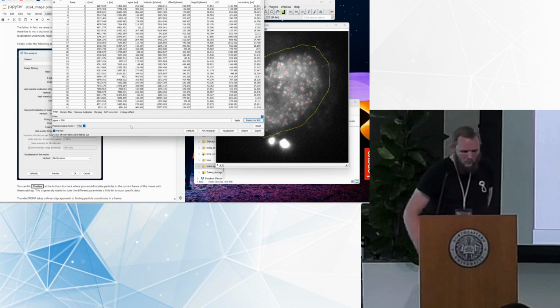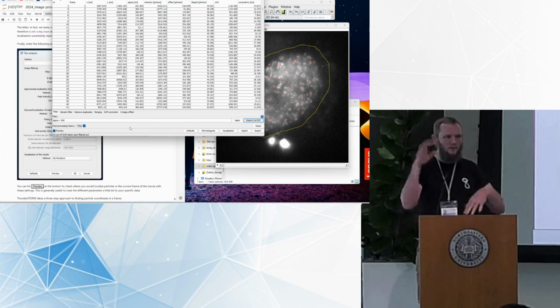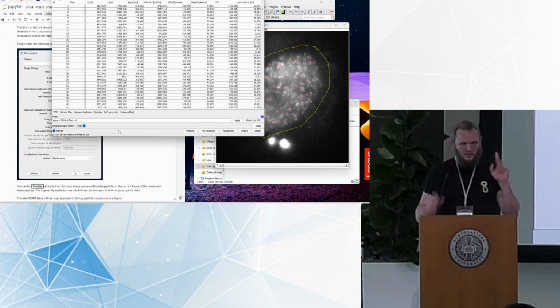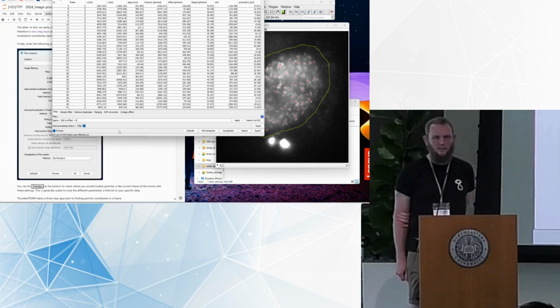So why don't you take 5 minutes to play with this filtering a little bit, see what filters you can apply, what you think makes sense. You can combine the expressions in this line here with logical operations. So you can do AND, offset greater than 0, or something like that. You can also use an OR, you can bracket things, just general logical expressions. So play with this a little bit, figure out what filtering you think makes sense.